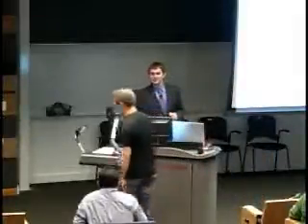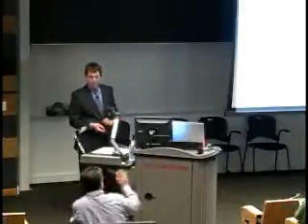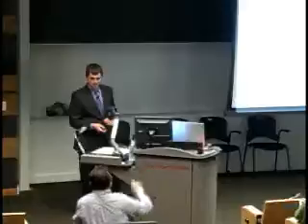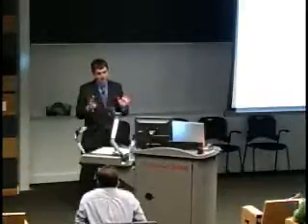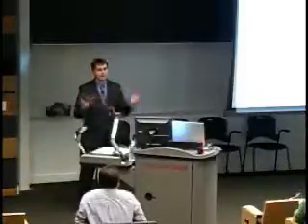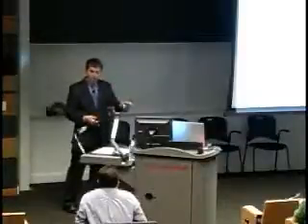Fabio, you have a question? Oh yeah, quick question. It seems to require an initial input from the user to specify an initial boundary. How hard is it to make it fully automatic? So that's the holy grail of the project, right? How do we do this completely automatically? We are looking into this right now. We are looking into Markov random field approaches for this problem so that we can easily know how many neurons there are in the dataset. How can we process them automatically? We don't have anything that is fully automatic yet. But in the meantime, we have something that the neuroscientists can use to trace individual neurons in the data. But that's the holy grail, yeah. How do we do this fully automatically?